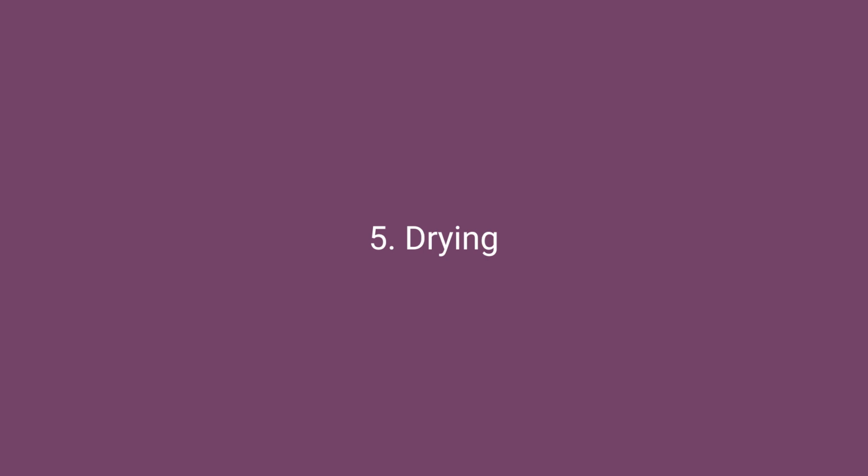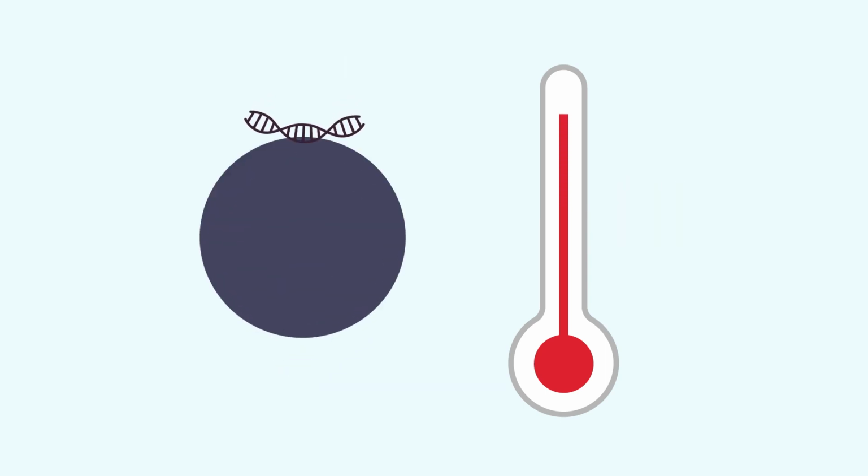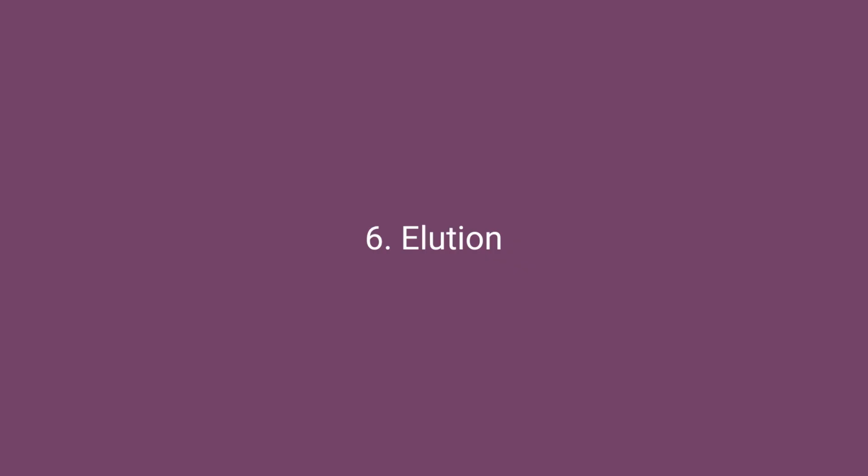Follow the kit manufacturer's instructions or your manual protocol for drying. Drying at room temperature is slower, but tends to give consistent results. Higher temperatures accelerate drying, but can over-dry particles and give lower yields until optimized. To maximize processing speed, you will likely need to optimize the temperature and timing of this step.